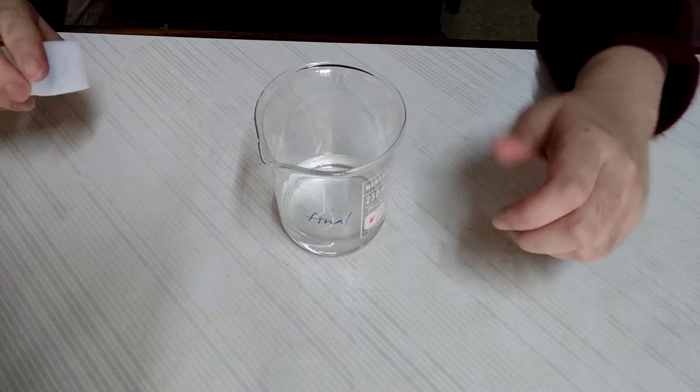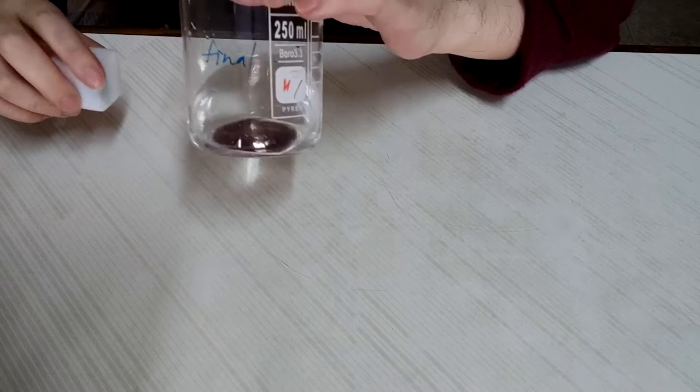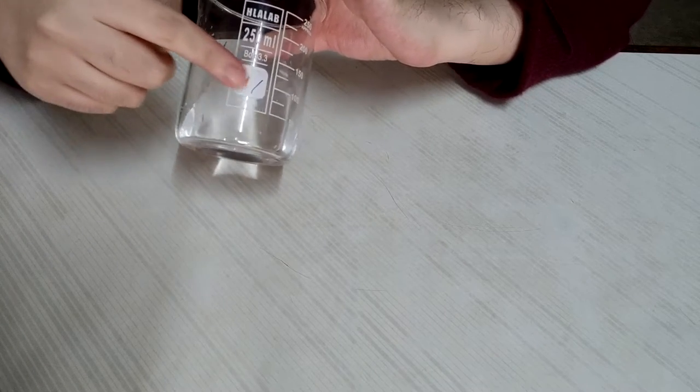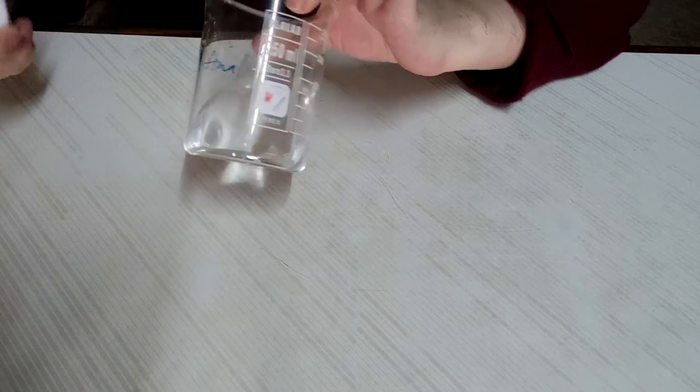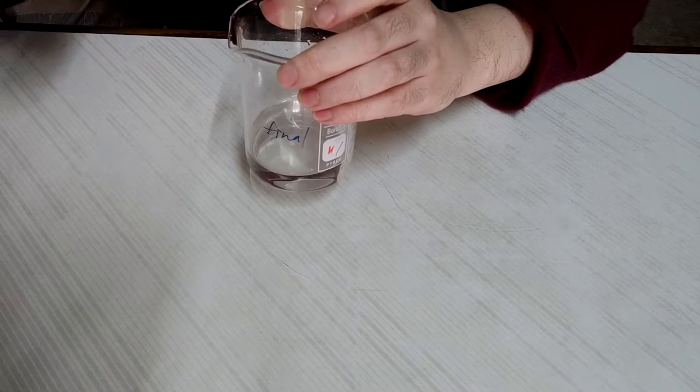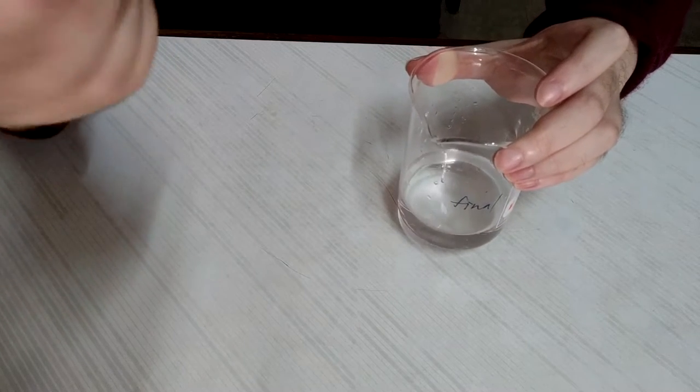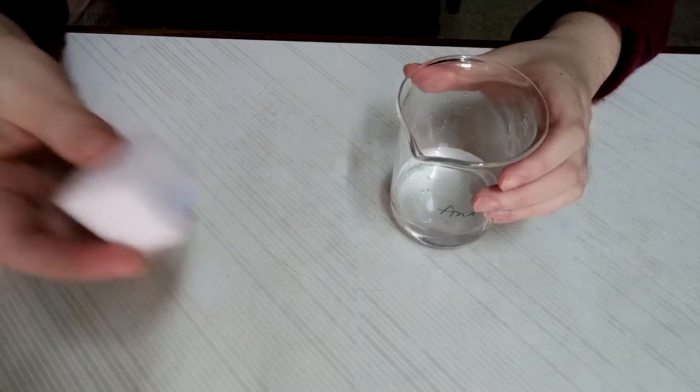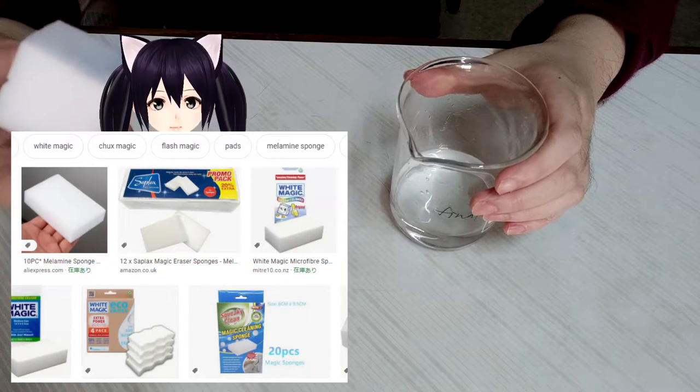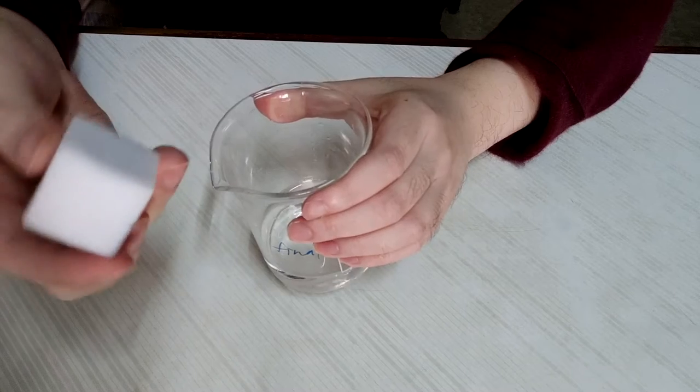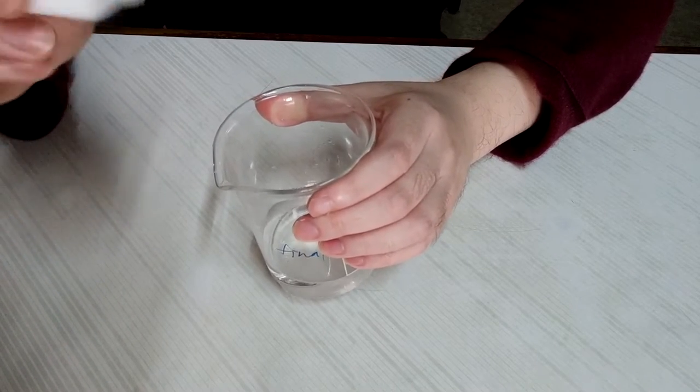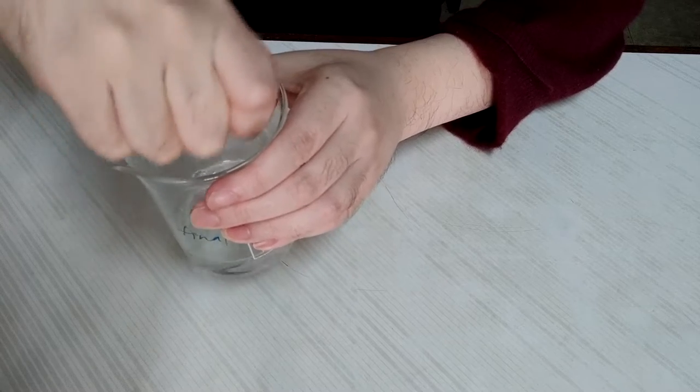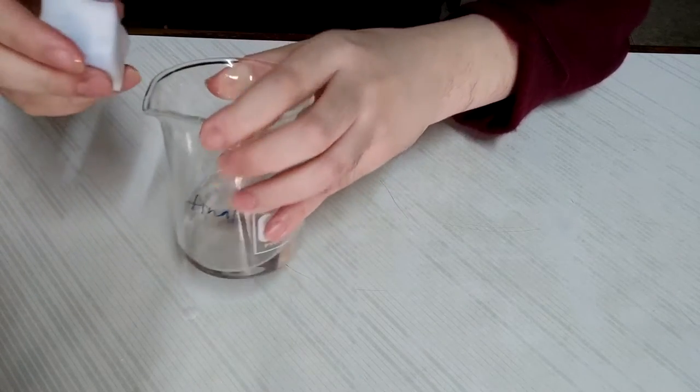Lastly, I'll show you how to clean off the labels written on glassware. In the past, usually we used ethanol or acetone to dissolve and wipe off the oil-based permanent marker. But nowadays there is a better alternative, and one of the best I can think of is the use of magic sponge, which is also called melamine sponge. You can buy it cheap from home improvement store or hardware store, and sometimes even in supermarket. To use this, you better wet it, then squeeze off excess liquid.